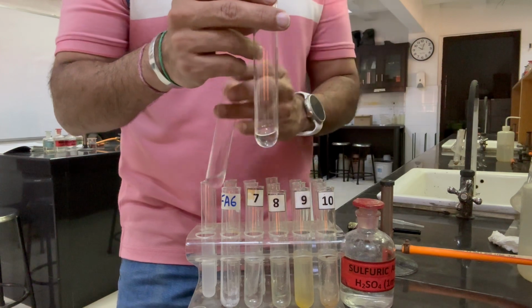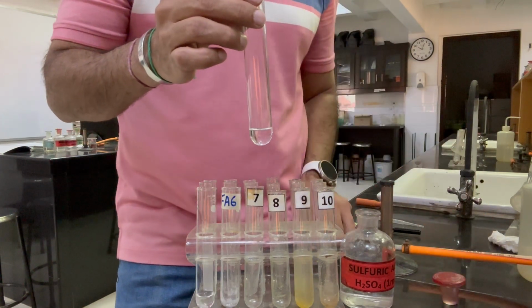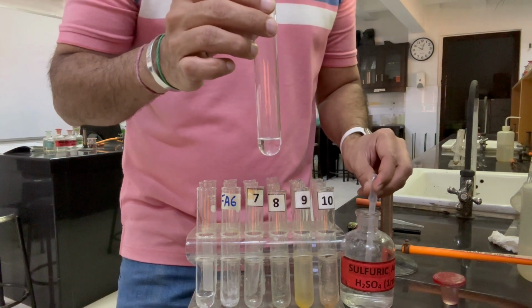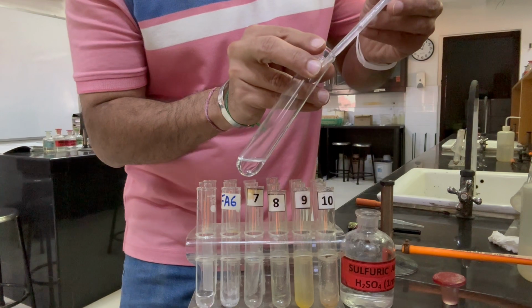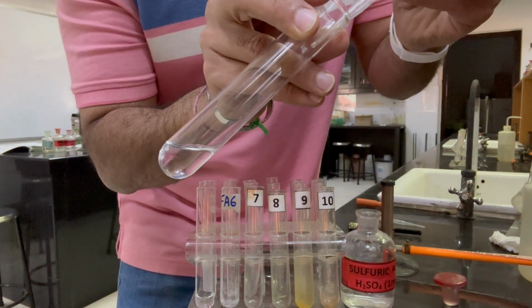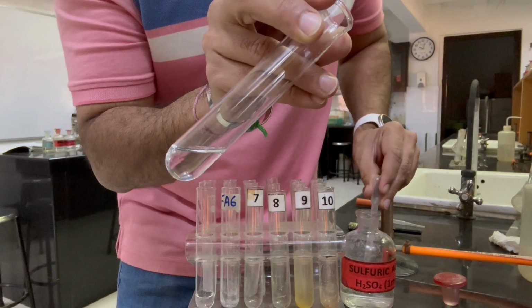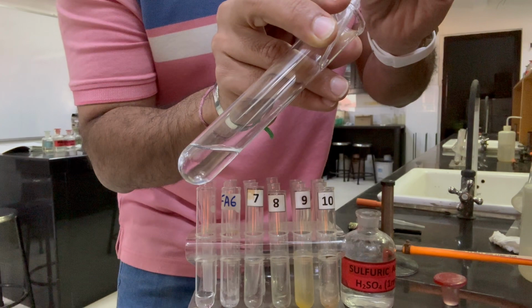And now we will add an equal volume of sulfuric acid. As soon as we add an equal volume of sulfuric acid, we can see there is no visible change happening.